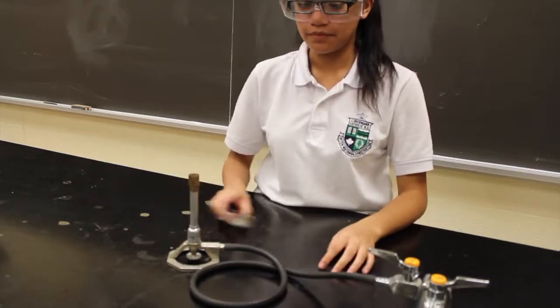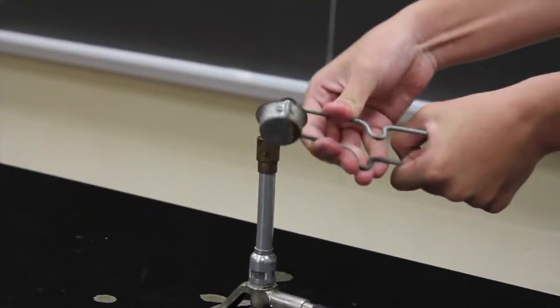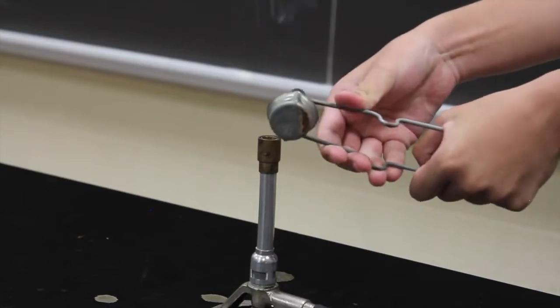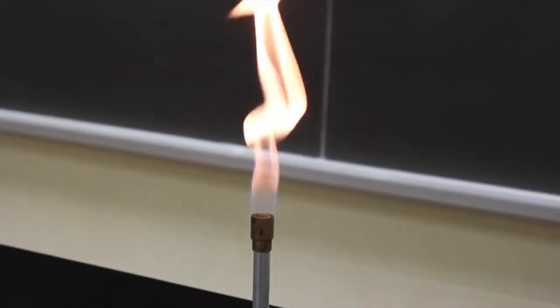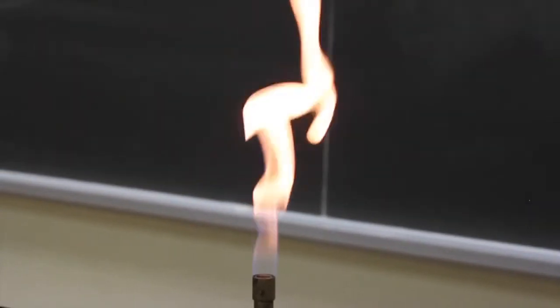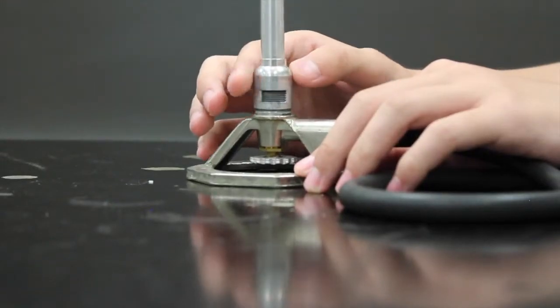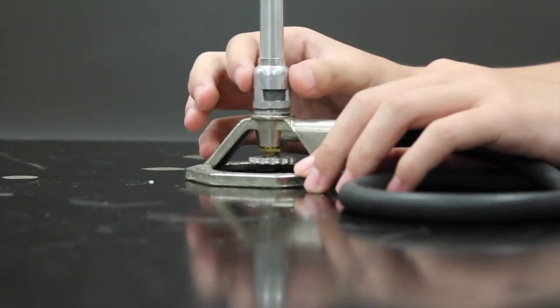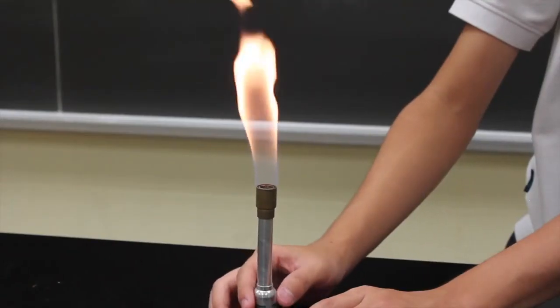To light a Bunsen burner, open the gas valve and use a striker or a match. If using a match, strike away from you, turn the gas on after the match is lit, and light the Bunsen burner from the side. Aim to have a small blue flame with a lighter inner cone, since a yellow flame is too cool. This can be adjusted by opening the air holes and letting in more oxygen for combustion. The size of the flame can be adjusted through the valve at the bottom of the Bunsen burner.